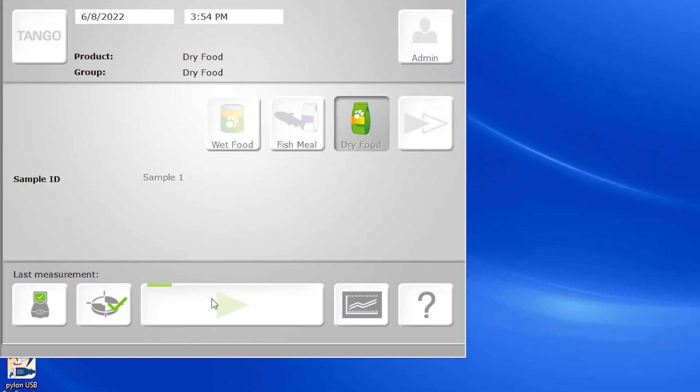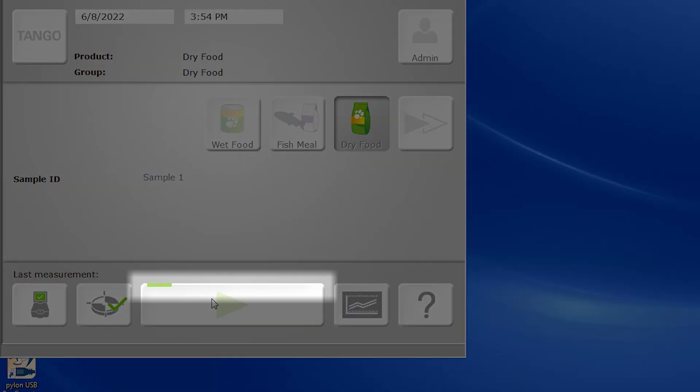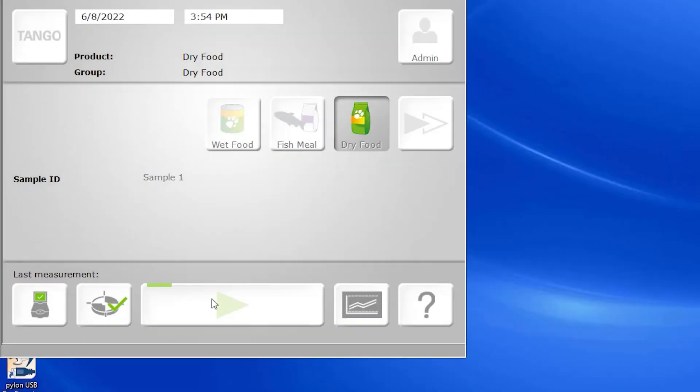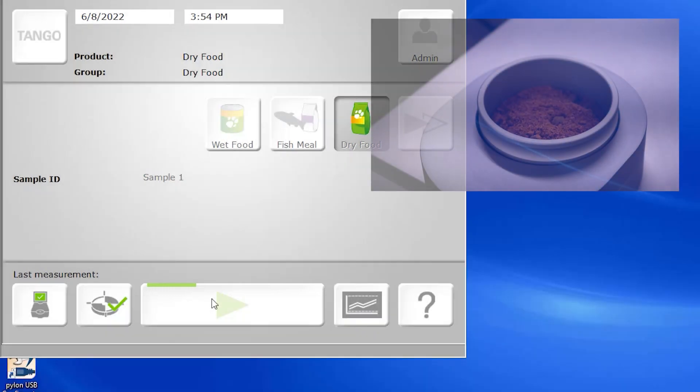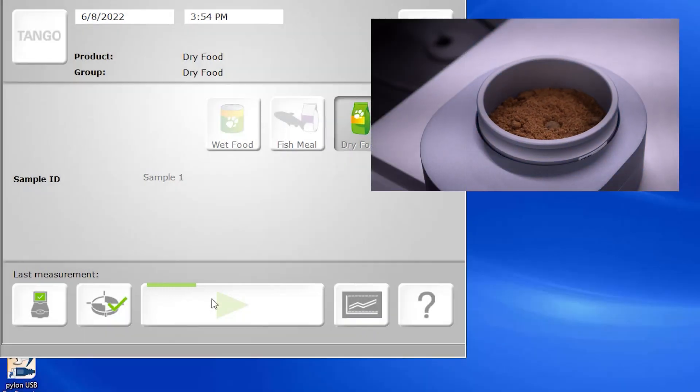While the measurement is being taken, we can visualize its progress with the green progress bar. We can also see that the sample cup is rotating around.